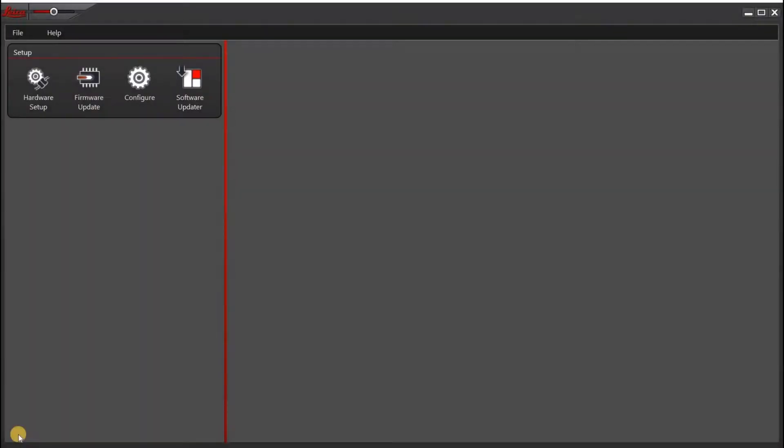In this video, I'm going to go over how to set up an offline configuration so you don't have to turn on your microscope whenever you want to use LASX. You may want to do this if you're planning on doing some offline processing or image browsing.